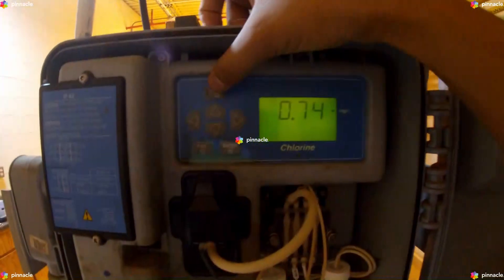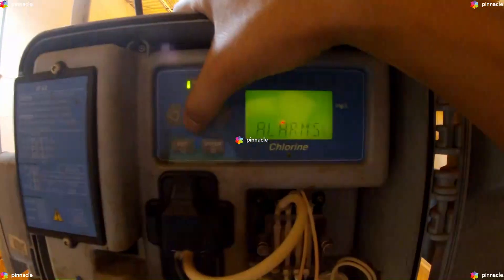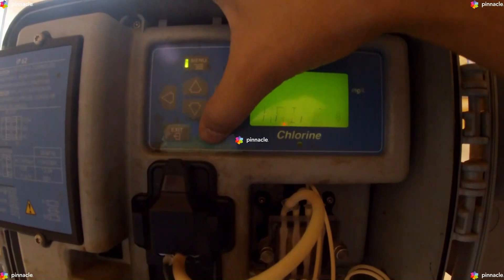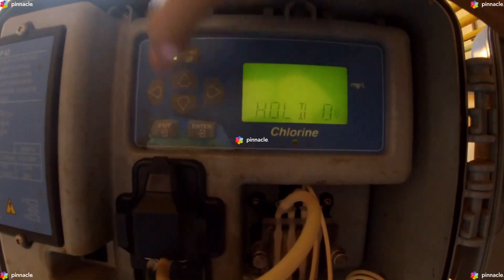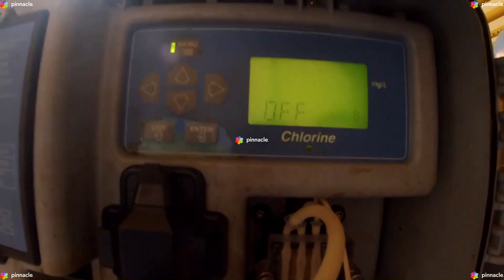We will begin by clicking on Menu. Scroll to Maintenance, Enter. Scroll to Hold Output, Enter. Scroll to On, Enter.